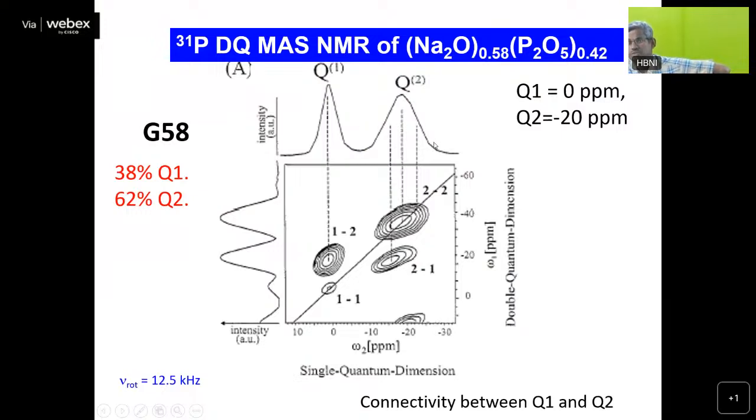It's because something to do with the rigidity. Probably we will not explain it furthermore. And if you see the chemical shift value also, see here, the peak corresponding to 2-1, which is merged in the 1D spectrum, is slightly having a positive chemical shift. You see here, 2-1, 2-1.